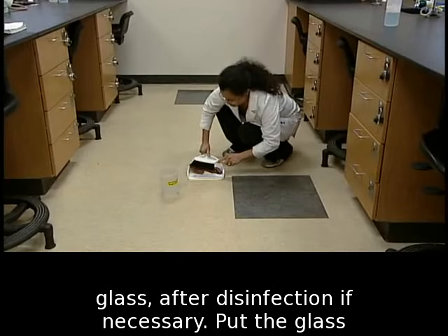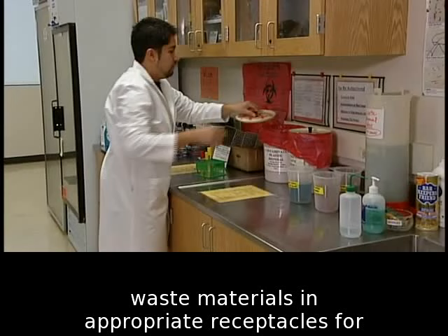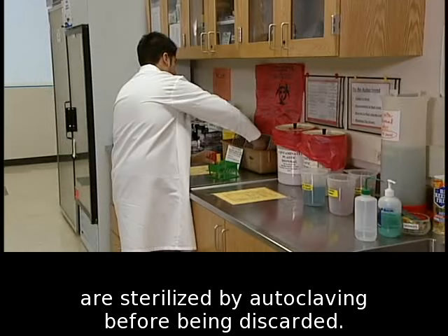Put the glass in the broken glass receptacle and wipe up any liquid. Place all contaminated tubes, plates, and waste materials in appropriate receptacles for sterilization. Contaminated glass and plasticware are sterilized by autoclaving before being discarded. Decontaminate the work surface with a disinfectant after completing lab work.